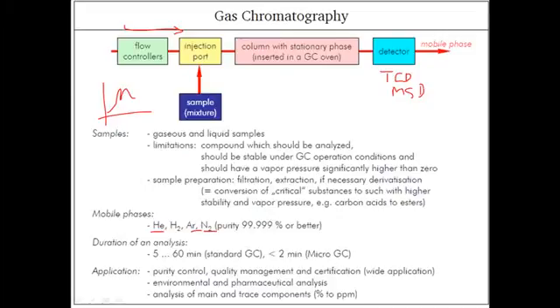So what is going on in this case is that the sample is transferring from this place, and the flow is going in this direction. This is the mobile phase, whose molecules pass through here. The mobile phase molecules make the sample pass through the column and finally enter the detector. When the detector detects it, it is attached to a computer, which processes the data and shows it on the monitor screen, and we can measure the peak height and the area for quantitative analysis. At the end of the detector, the mobile phase, which is not needed for further purposes and is useless now, is discarded or released from the system.